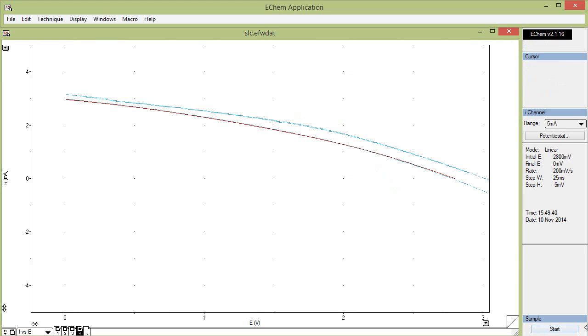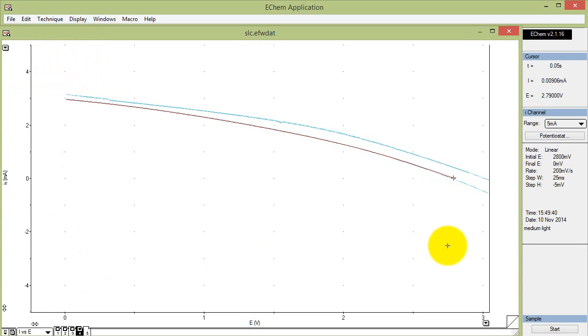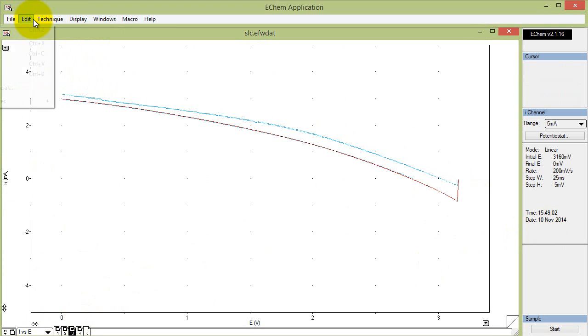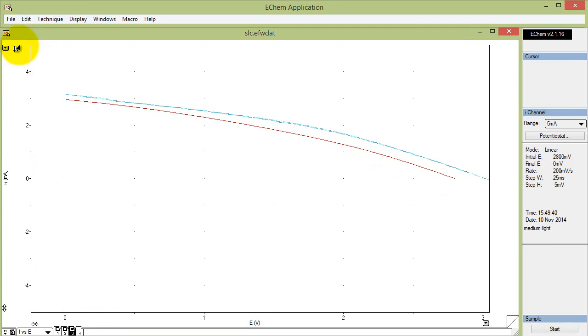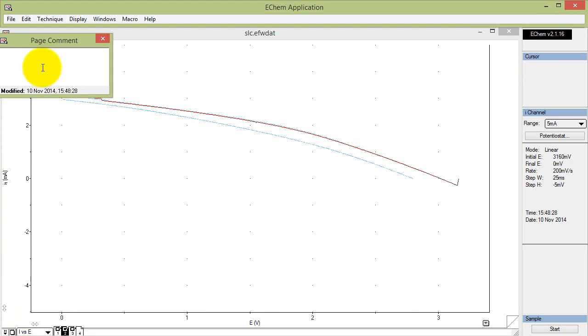And you can continue doing scans under different lighting conditions. You can make a record of the lighting conditions using the notes. So in here, for example, you could call this medium light. There's a note of that here. This one was an earlier run, we can cut this one. Number 2, for example, this could be high lighting condition.